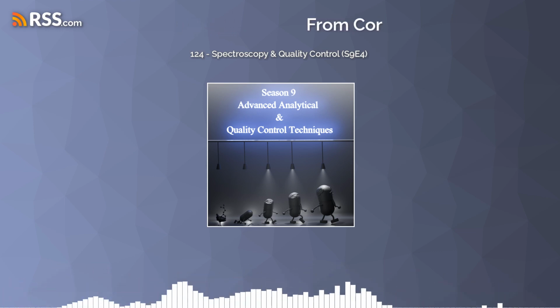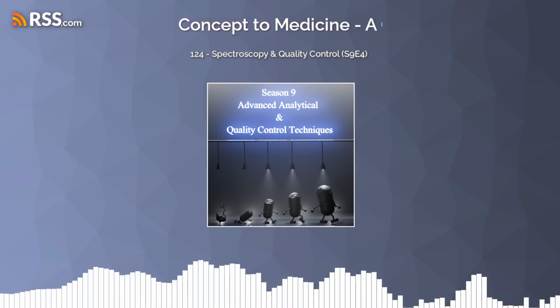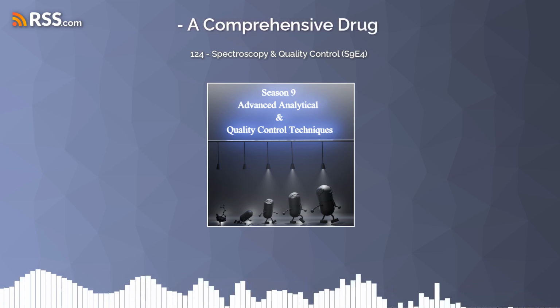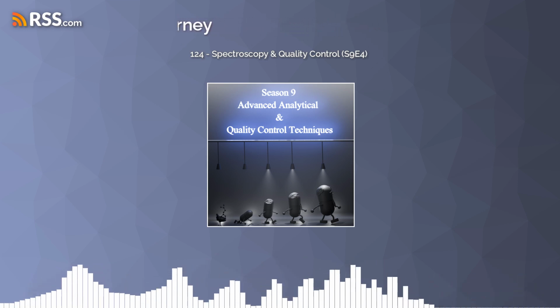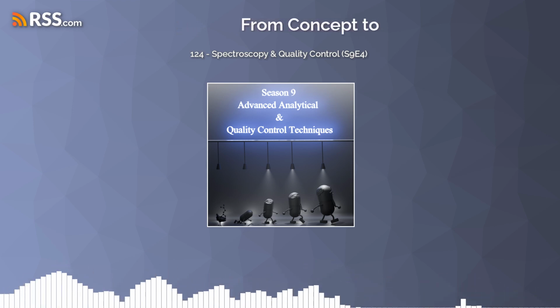That's pretty impressive. What else? Another advantage is that water doesn't scatter Raman light very strongly. So this makes it really useful for analyzing aqueous solutions, things that are dissolved in water or biological samples, which are very common in the pharmaceutical world.